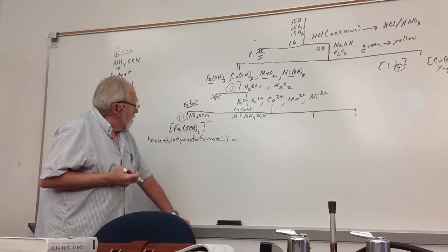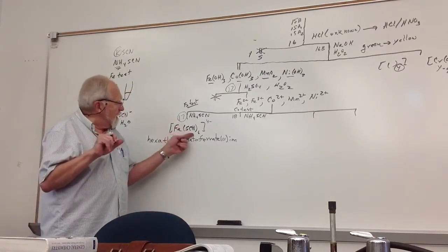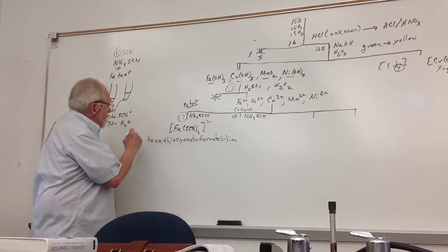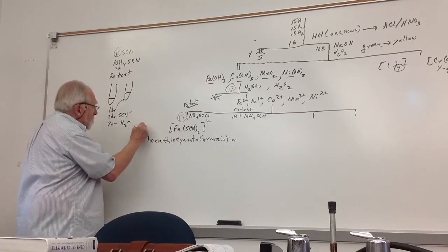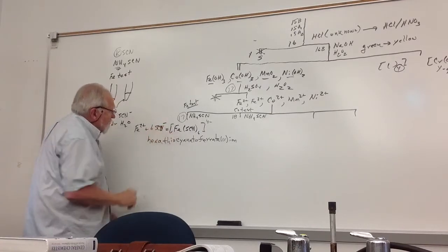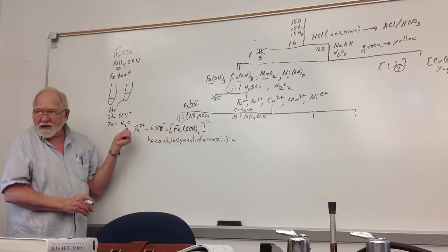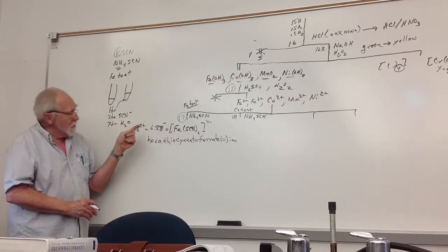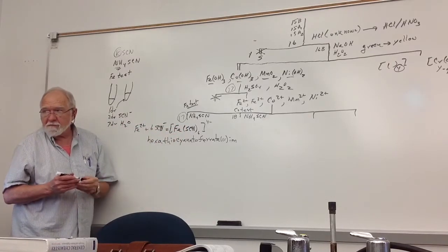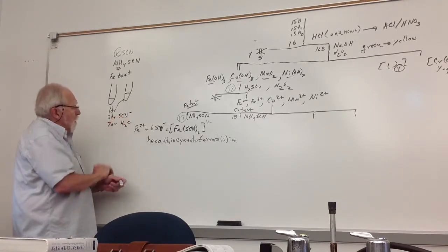And by the way, you notice this, when the Petrucci book talked about it, he used the formula FeSCN4. And that's because as you dilute the thiocyanate, let me write the equilibrium here. SCN minus. There's the equilibrium. As you dilute it here with the drops of water, it'll shift this way and break down more, and you get a lighter color. So the reason for adding the 2 extra drops of thiocyanate is to shift it this way. Okay? So that's why I had you add 2 drops of thiocyanate.